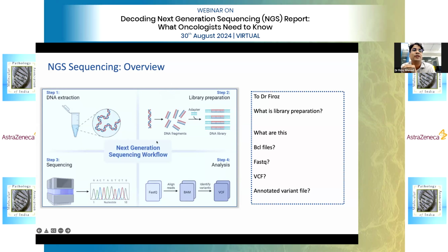So you fragment the DNA and ligate it with certain adapters and molecular barcodes. These adapters are universal sequences, which help the DNA get sequenced during NGS analysis. A pool of DNA fragments with adapters and molecular barcodes is called a library. These are the molecules which go into the sequencer. So technically, day 5 you put in your library, and day 6 your library is prepared. Again there is a quality check, wherein you check the library quality and concentration, and if it is good enough, you take it for sequencing.